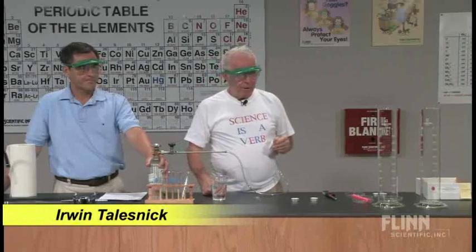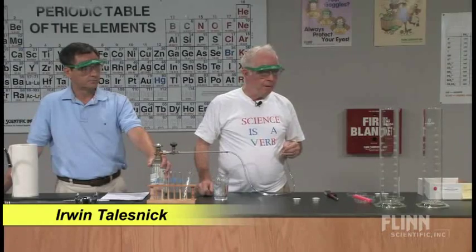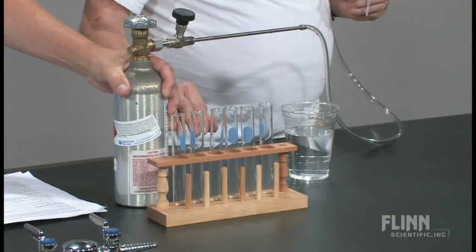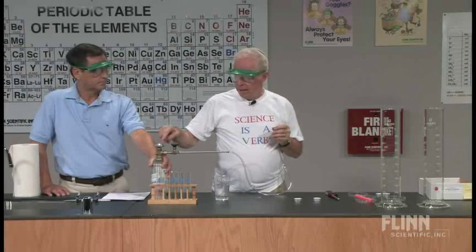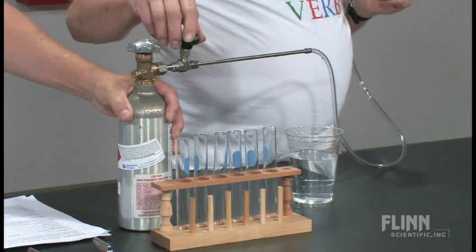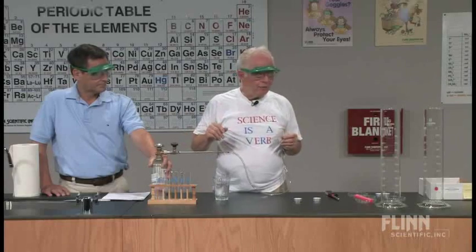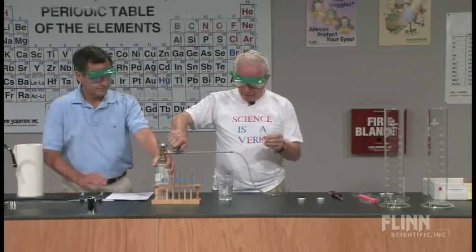We're going to study the combustion of hydrogen gas in a rather interesting kind of way. The first thing I'm going to do is fill these test tubes with hydrogen gas from the cylinder. This valve on the cylinder is opened slightly — this is my fine control. Although it's not as fine as it might be, so there might be a little bit of splashing. But with practice and you get used to the valve that you're using, you can control it fairly easily.